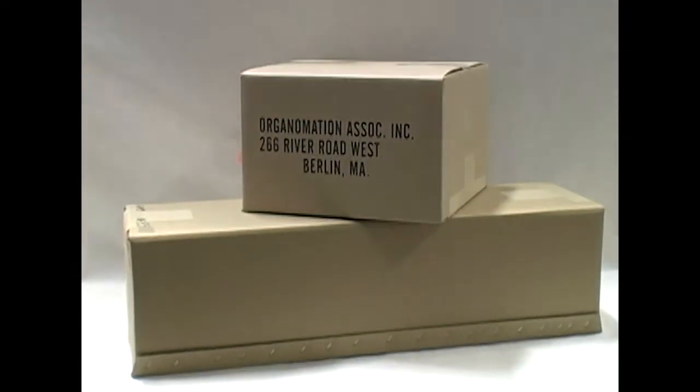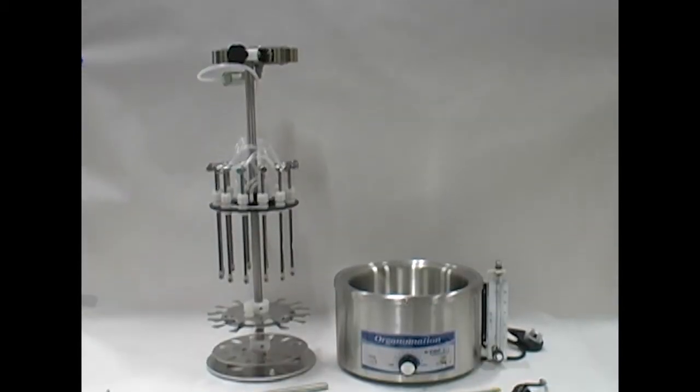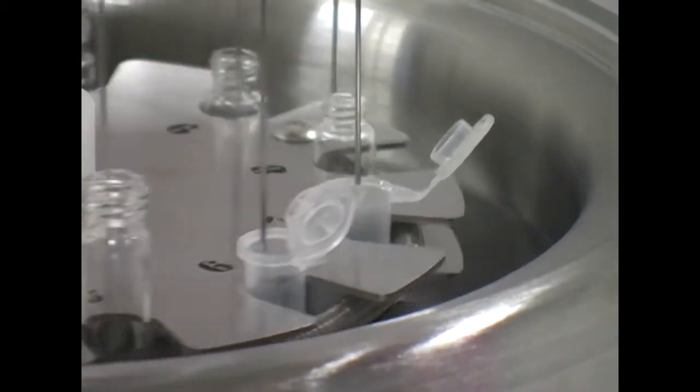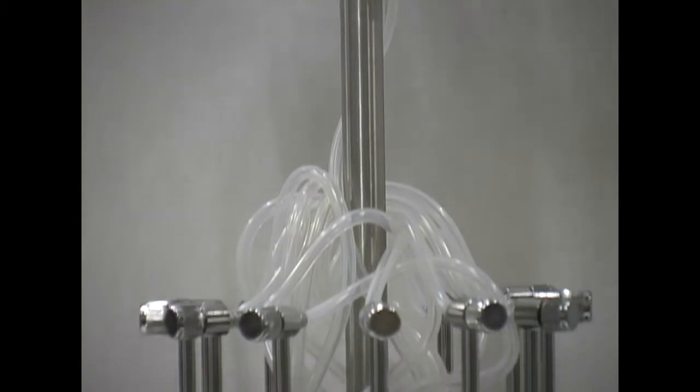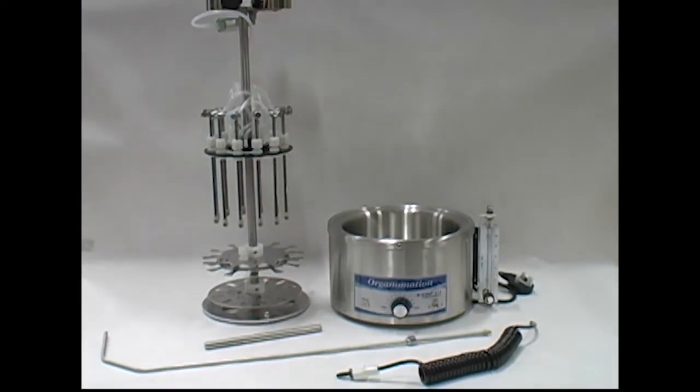First, carefully check the contents of all cartons received for any damage which may have occurred in transit. Retain all cartons and packing materials until the instrument has been assembled and tested. Contact Organimation immediately if any damage or discrepancies are found.